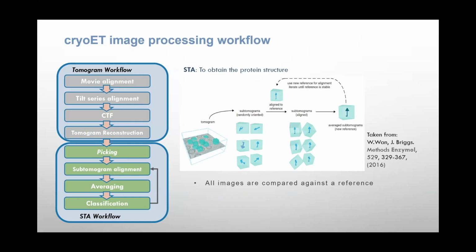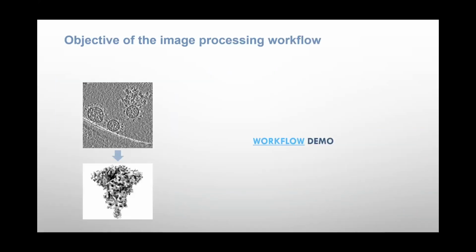So this is the subtomogram averaging. To do this, we have some images that are quite noisy because of the difference of densities between the solvent or the ice thickness, because in the cell we do not have solvent. It's just the ice and the atoms that compose the proteins. So we want to reconstruct this 3D structure from these noisy images.